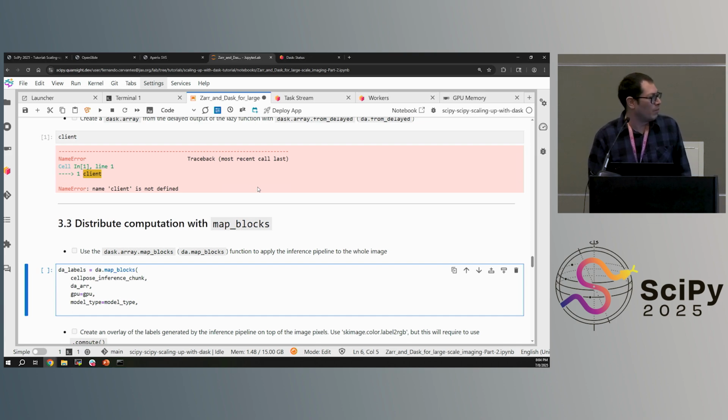So this is a model, and how it is structured is that it is an instantiation of a class that you need to use an evaluation method to perform inference. So let me show you how to do that with Cellpose. So we need first to apply some transforms to our image.